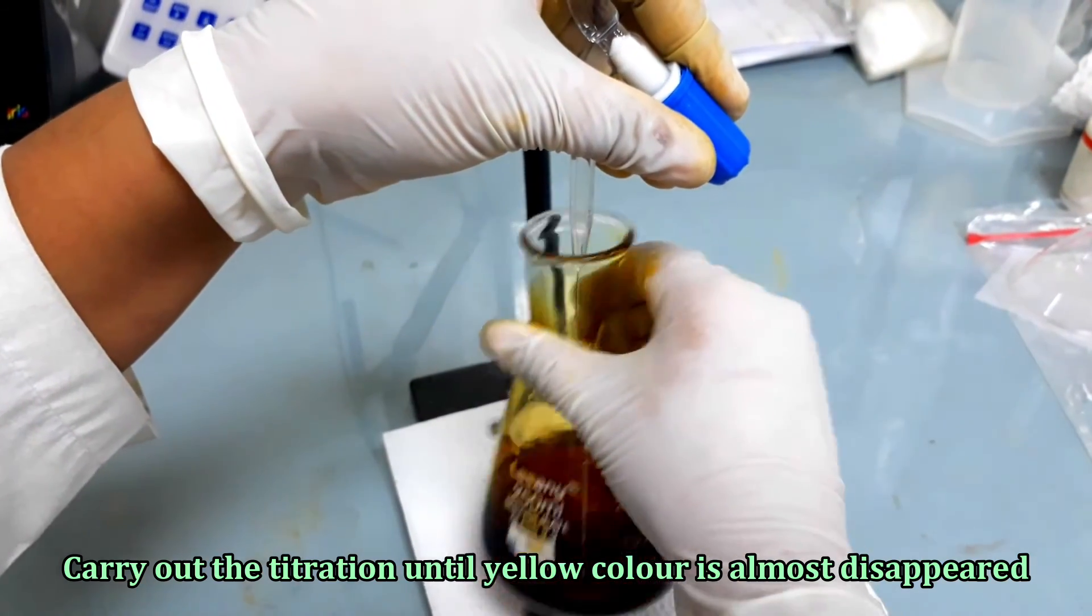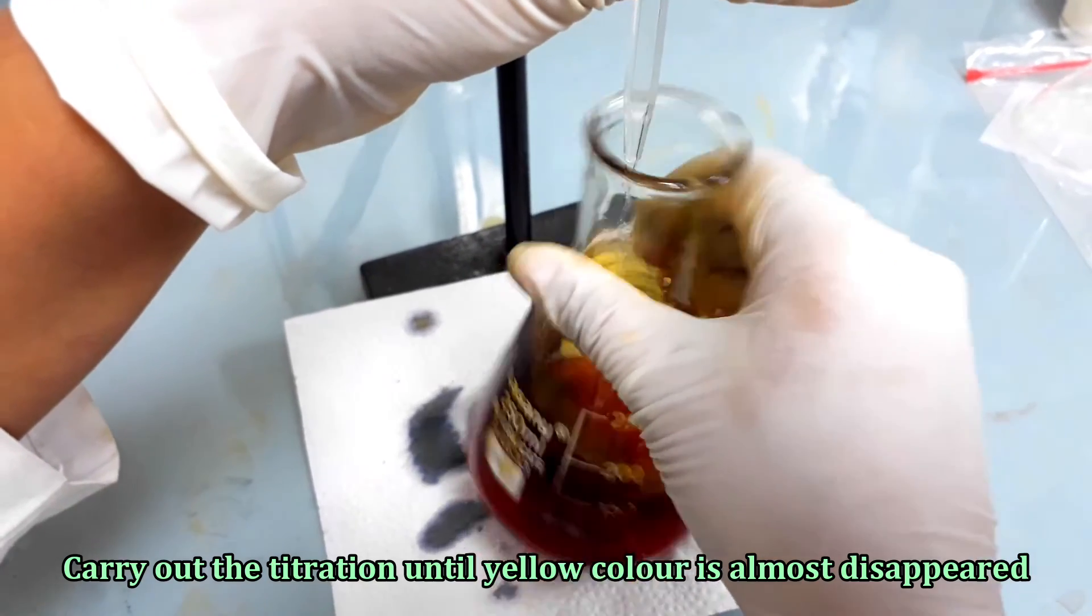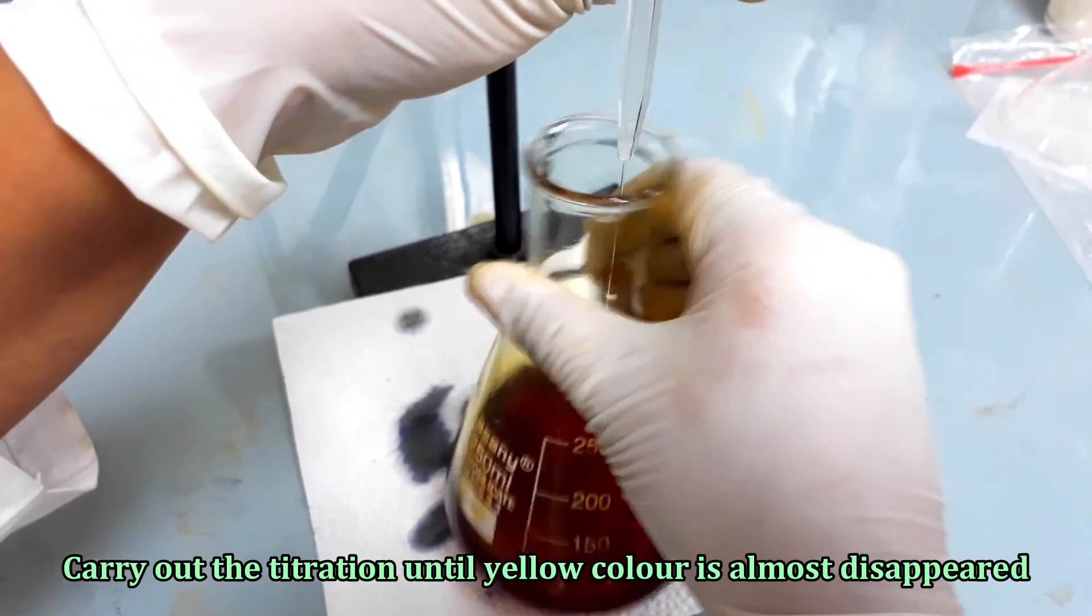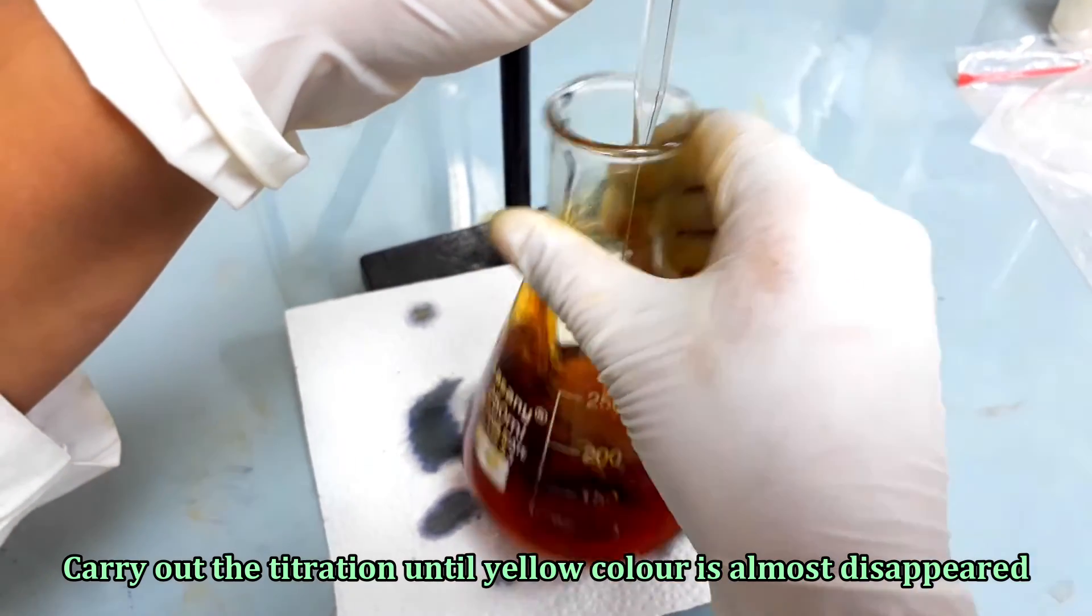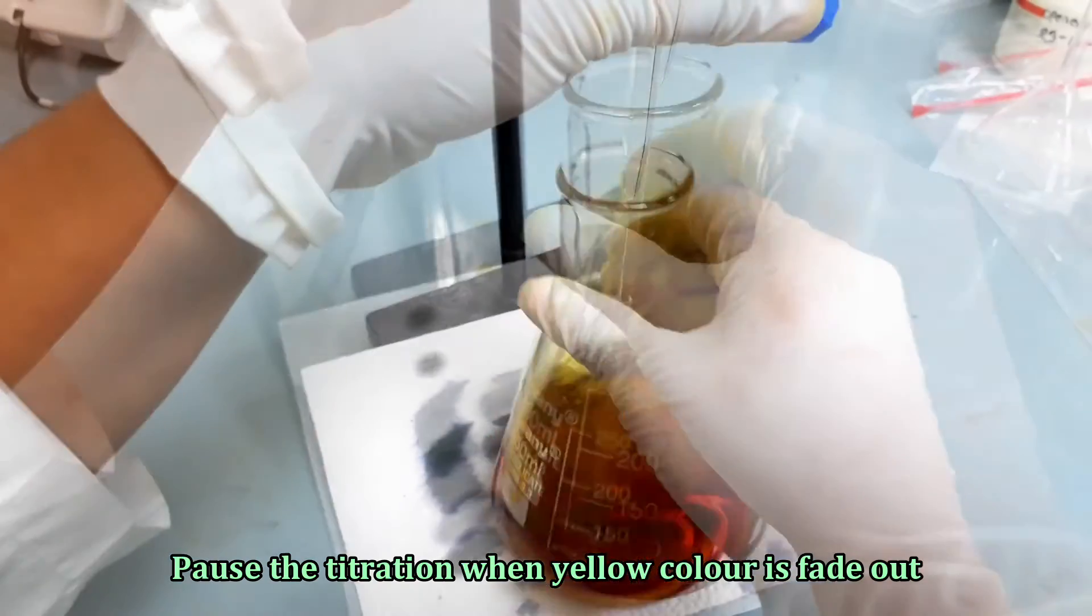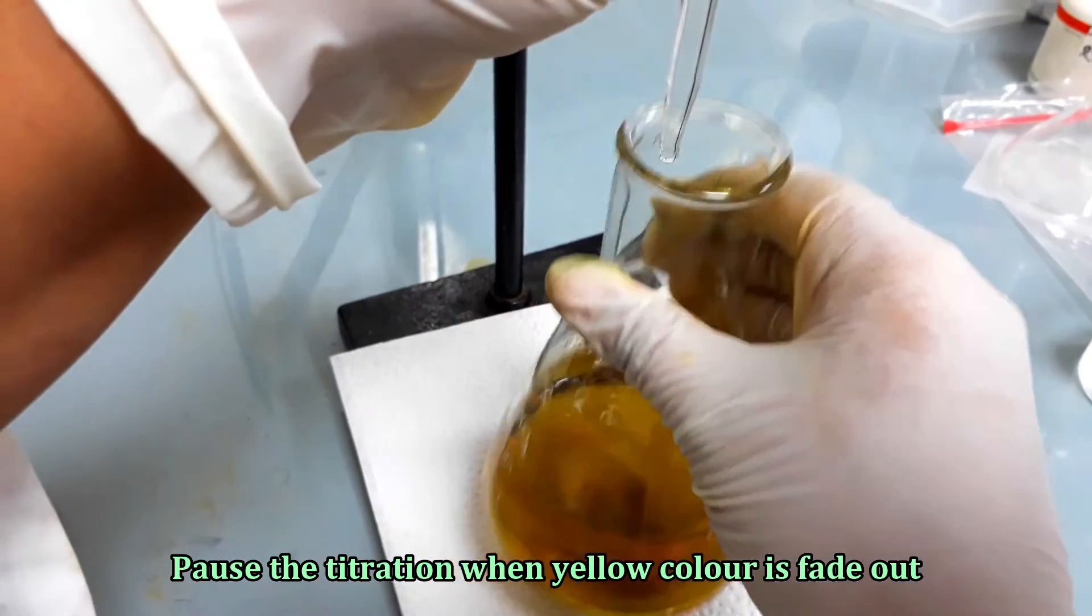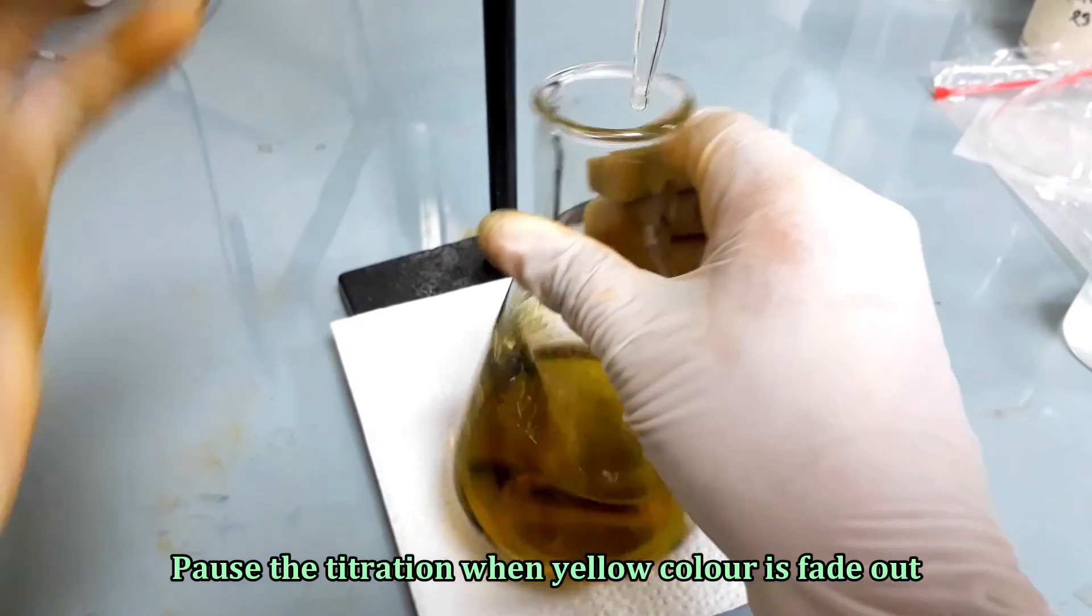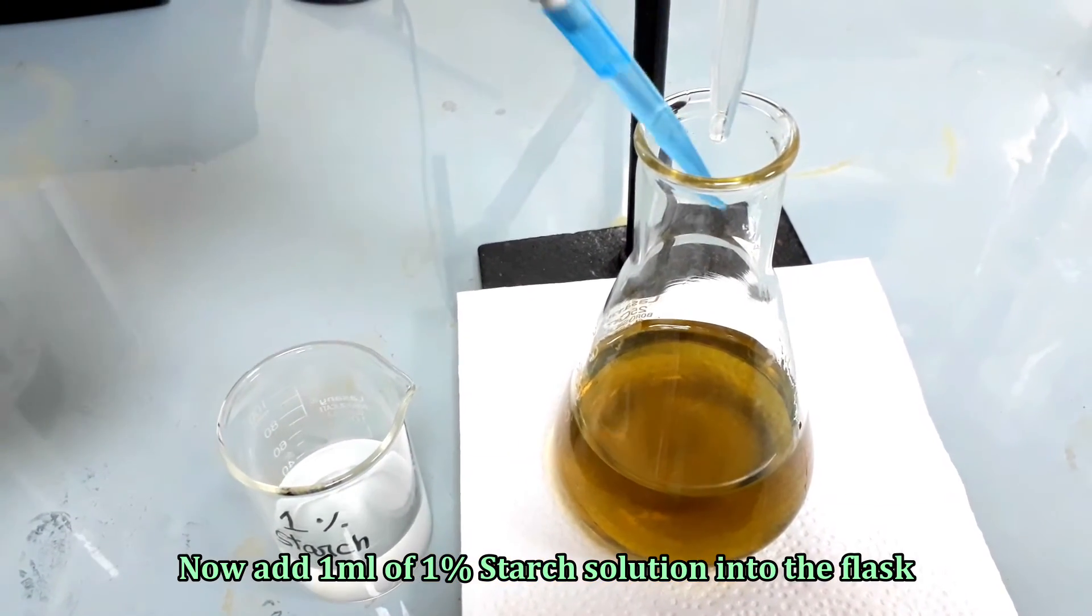Carry out the titration until yellow color is almost disappeared. Pause the titration. Now add 1 ml of 1% starch solution into the flask and resume the titration.